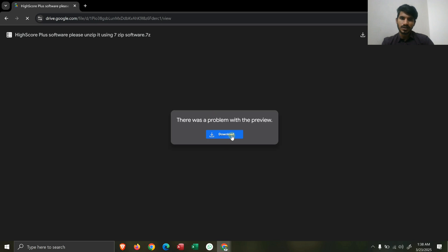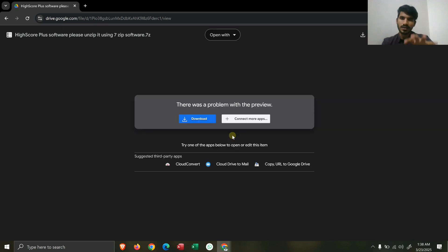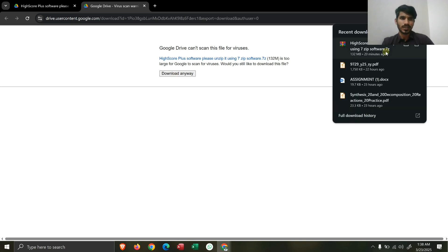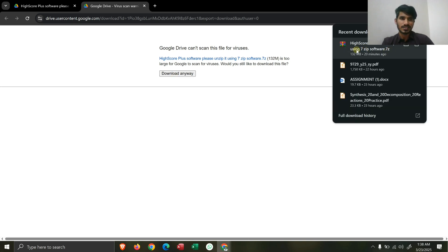Your screen will show this page and then you have to click on the download button. After that a screen will appear and you have to click on 'Download Anyway.' When you click on this 'Download Anyway' button, Expert HighScore will be downloaded, and you can see this is the file here that's downloaded.